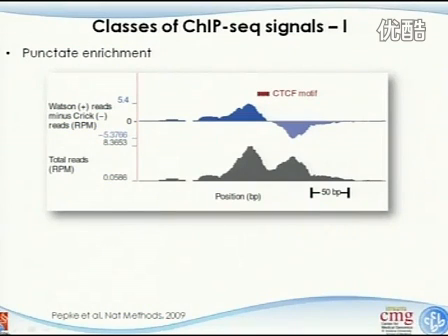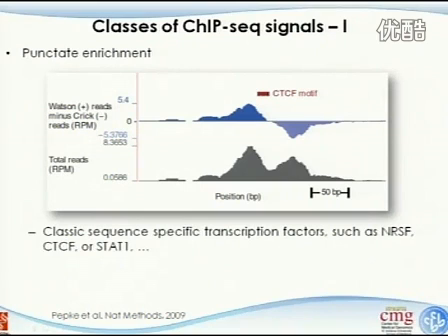And this part is from the negative strand. It's called Crick reads, right? Negative strand of the DNA. So if you accumulate them together, it will look something like this, the total reads. But you can see a clear separation between the positive and negative strand. They form two different peaks. Okay, we'll talk about that in later slides.